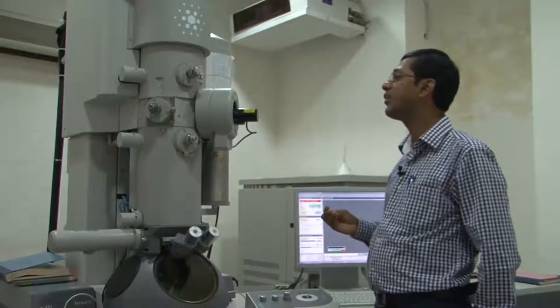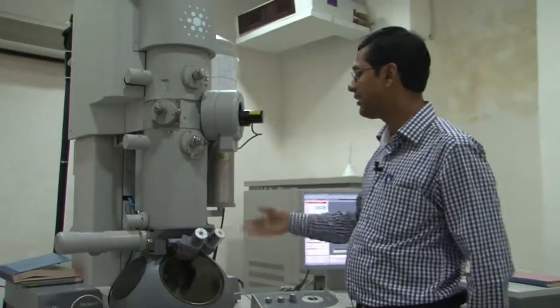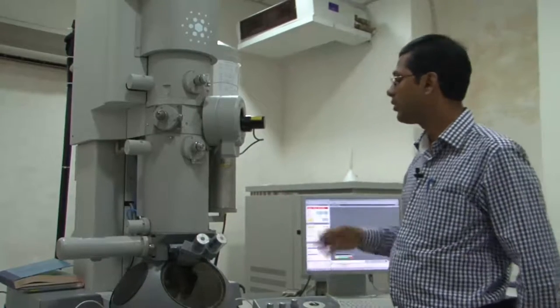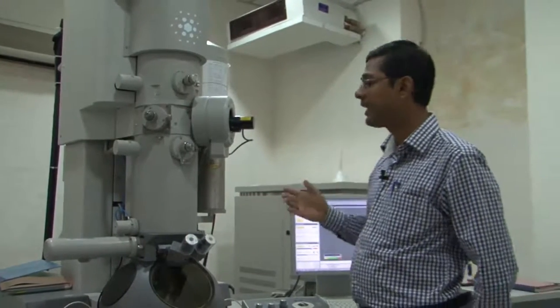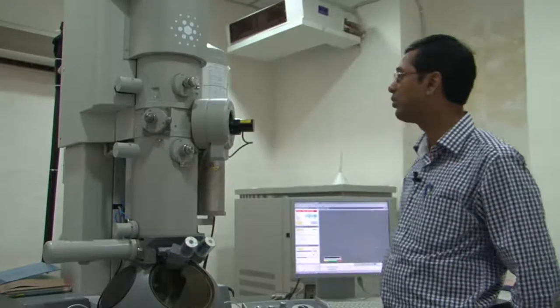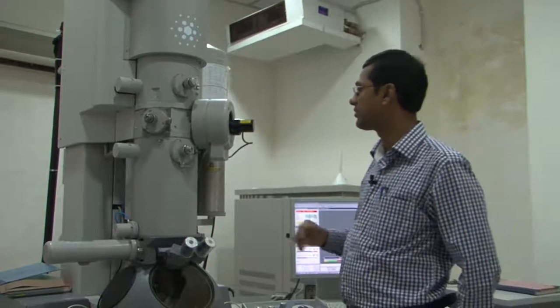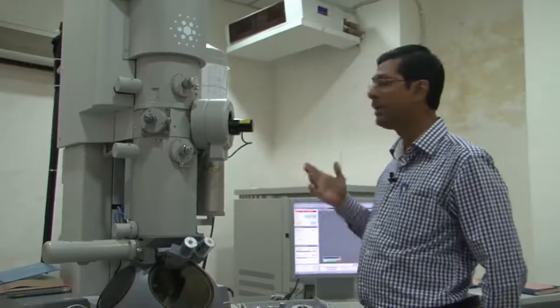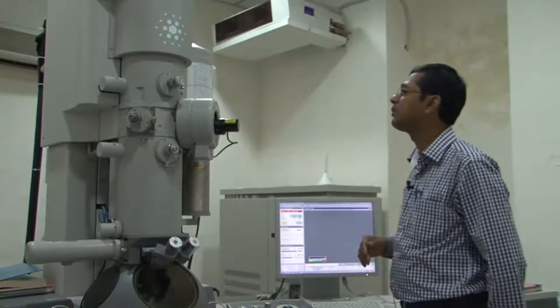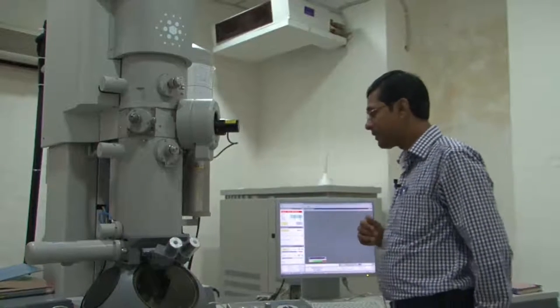Those contaminations cannot be allowed to go to the vacuum system, or it can actually create the backup system to be contaminated. So to keep it contamination free, we have an anti-contamination device like a liquid nitrogen cold trap, which can take care of all these contaminations. So this liquid nitrogen tank needs to be refilled intermittently to get a very good vacuum inside the column of the microscope. Well, there are several attachments to the microscope.